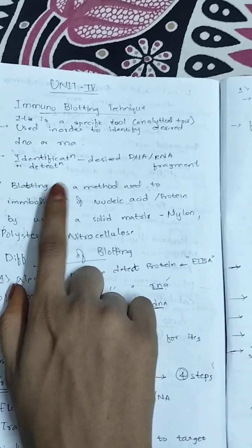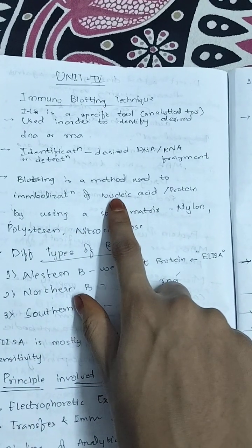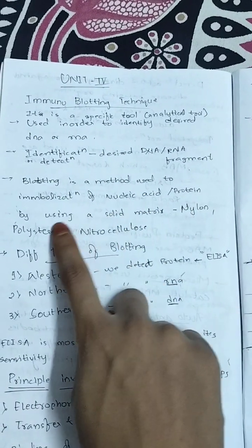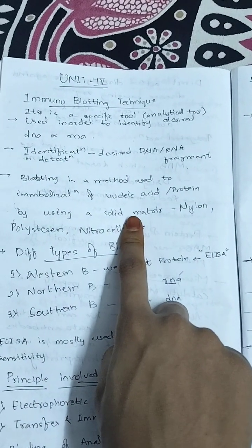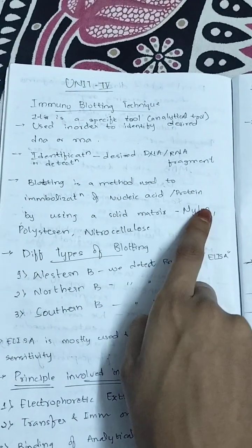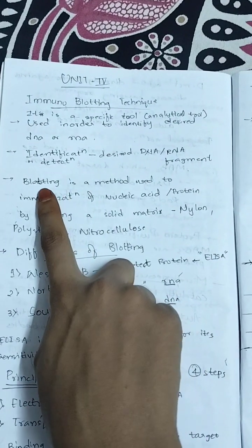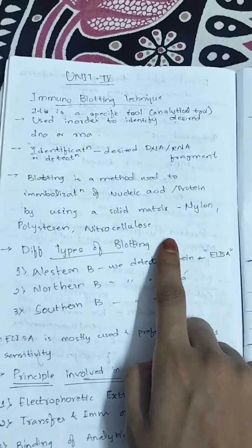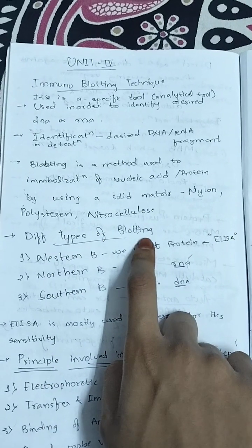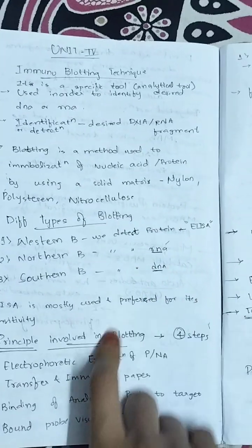Now, what is blotting? Blotting is the immobilization of nucleic acid or protein with the help of a solid matrix. Immobilization of nucleic acid or protein by using a solid matrix is known as a blotting method. Examples of solid matrix are nylon, polystyrene, and nitrocellulose.